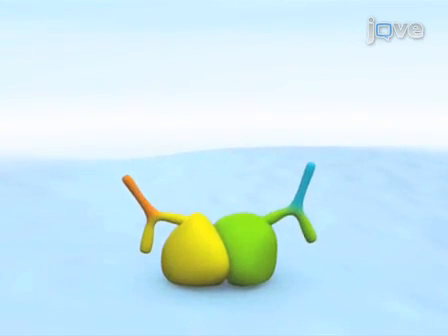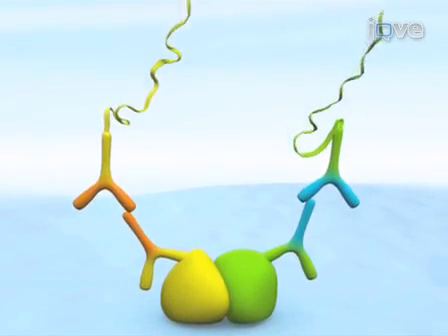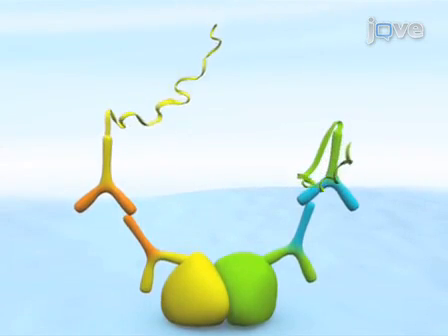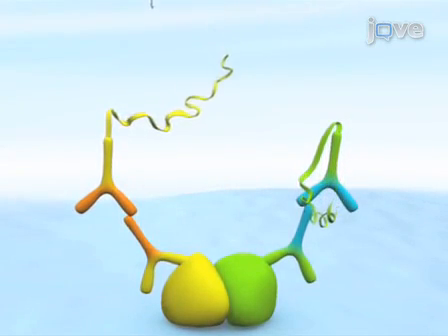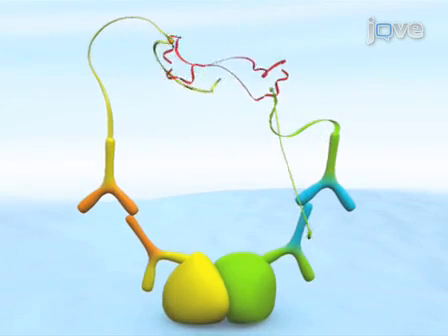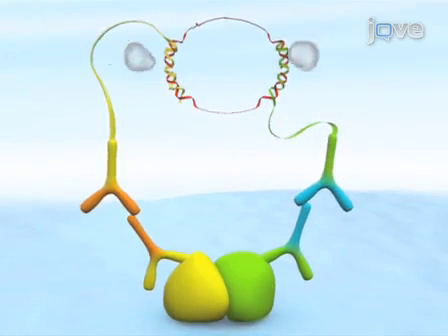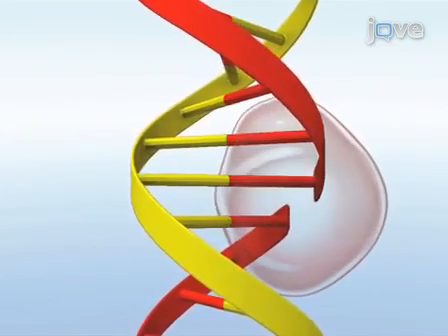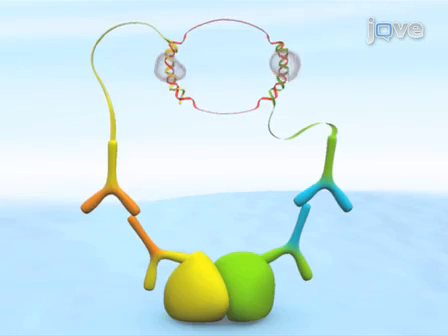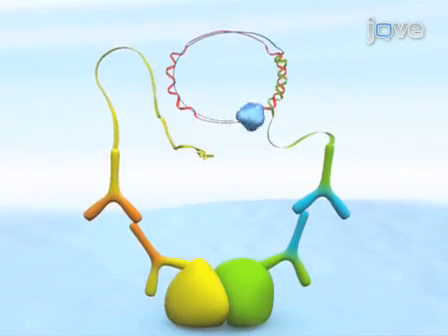Secondary antibodies, called PLA probes, each with a unique short DNA strand attached to it, bind to the primary antibodies. Where the PLA probes are in close proximity, the DNA strands interact through a subsequent addition of 2 circle-forming DNA oligonucleotides. These are joined together by enzymatic ligation and form a circle that gets amplified via rolling circle replication.